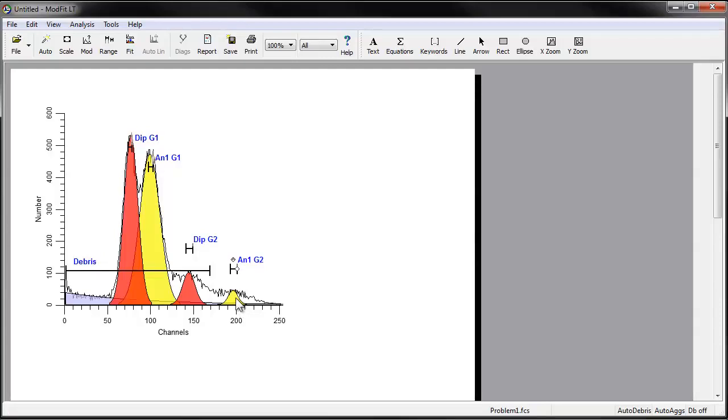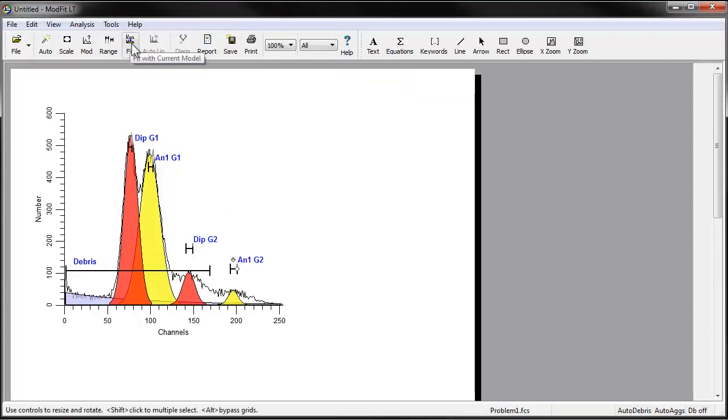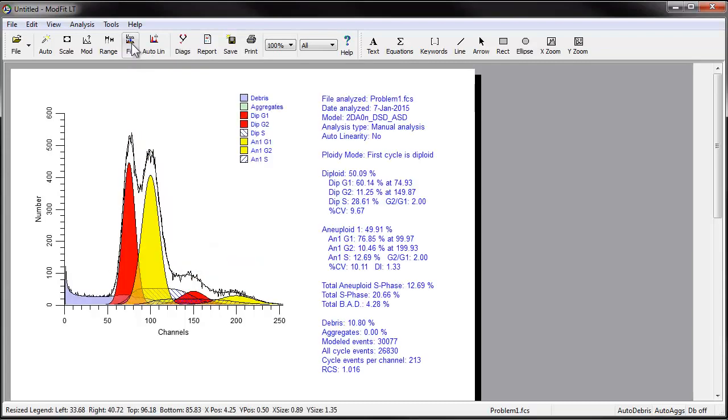With the ranges in position, you're ready to analyze the sample. Click the Fit button on the toolbar to perform the nonlinear least squares fit. Be sure at this stage not to click the Auto button.